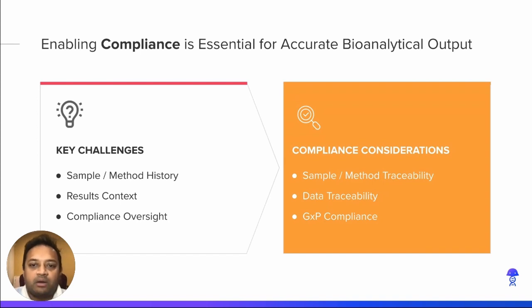Enabling compliance requirements is integral to supporting bioanalytical in early or late development. Every aspect of bioanalysis, starting from the biological samples to the method documentation, sample preparation and analysis, and results reporting, has to be traceable. This traceability facilitates compliance oversight and reduces regulatory risk. A digital solution must provide the necessary tools for enabling compliance with full traceability across samples, methods, experiments, and results.